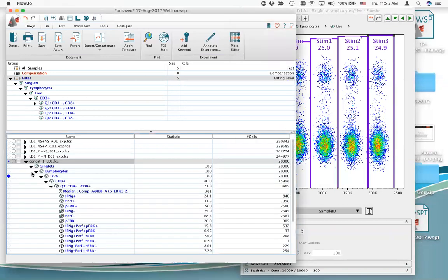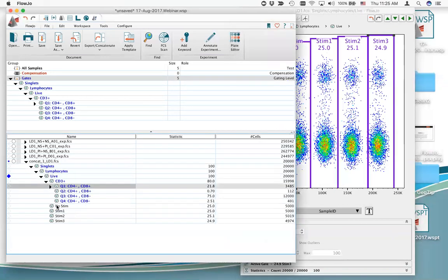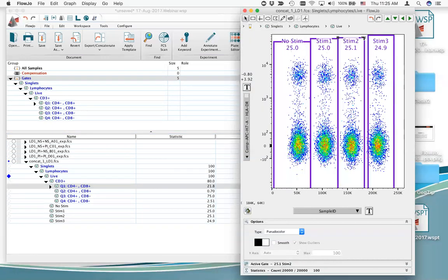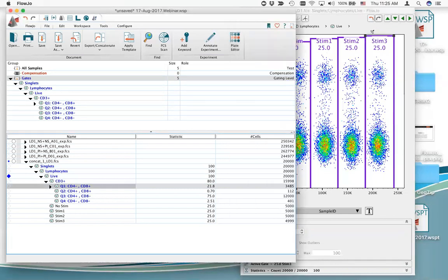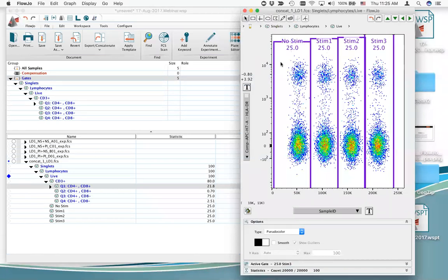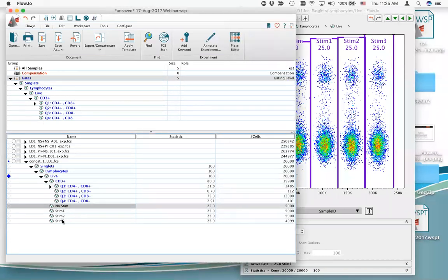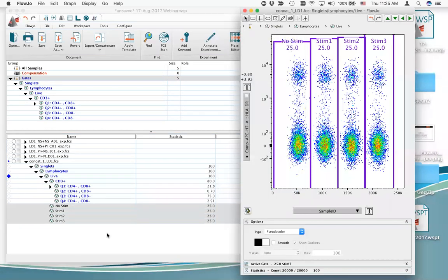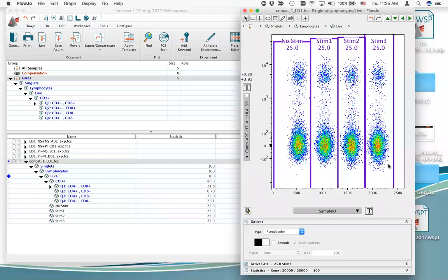I've got my gates on this concatenated file, done on the live node. My no-stim gate and each of the stim gates contain almost 25% each — which is exactly what I'd expect because I'm expecting 5,000 events per sample. Now I'm going to initiate the t-SNE algorithm on the dataset I've just merged together using the concatenation process. This will give us two new dimensionally reduced parameters representing all of the data in a single plot.